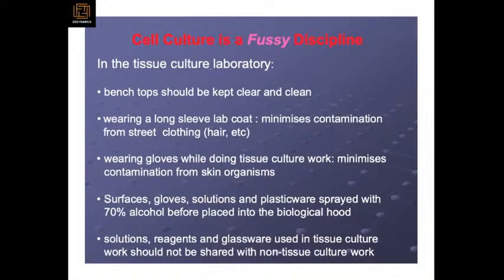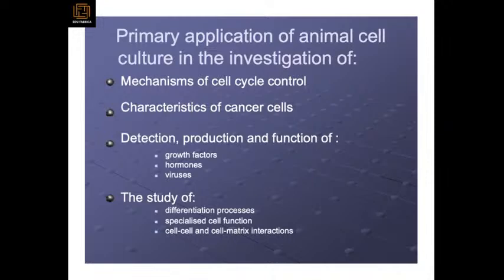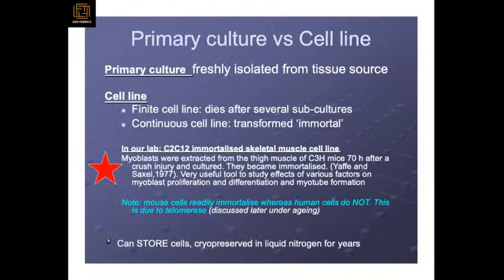Cell culture is a fussy discipline in the tissue culture laboratory. The bench top should be kept clear and clean. Wearing a long sleeve lab coat minimizes contamination from street clothing. Wearing gloves, so we have discussed this. Most of the things we have discussed here, I will not repeat.